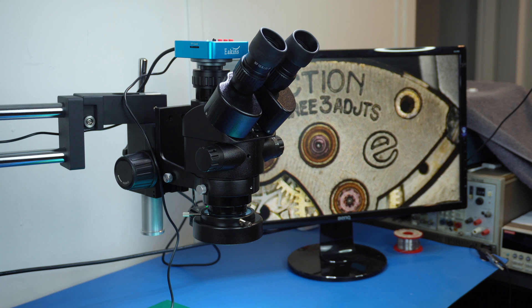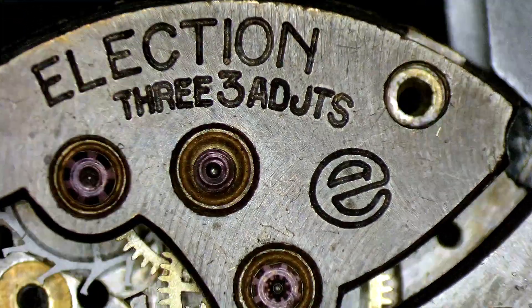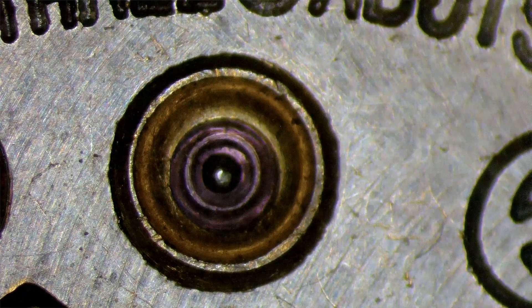So let's have a look at some footage from the camera. What you're looking at now is footage being recorded by the actual camera itself and it should look exactly the same as what I'm seeing on the screen. Going into full zoom and doing a focus - there we go, we can see we're focused on one of the pivots. I think that's pretty awesome - really really helpful. People have described a microscope as a giant game changer for watchmaking, and I think certainly for someone who's a beginner getting started out, that's true.